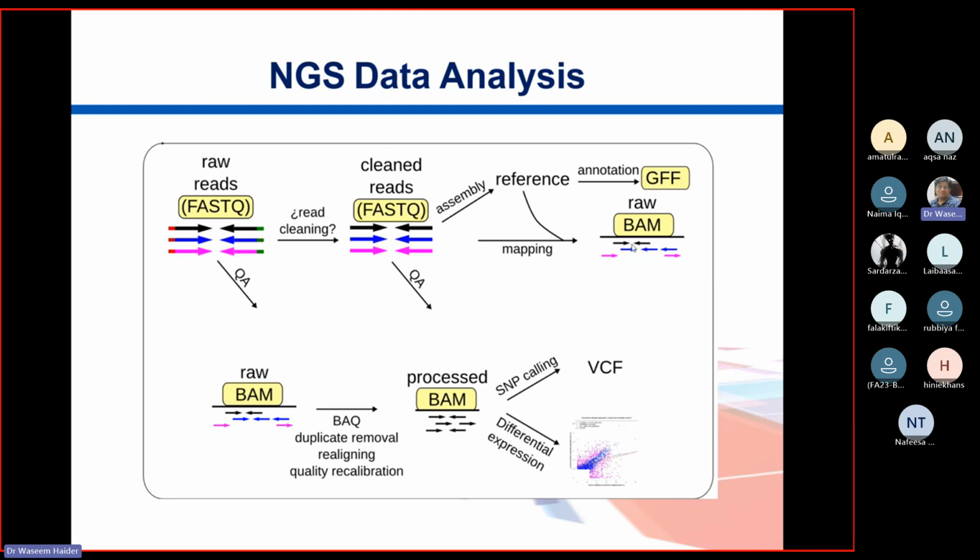So you have the reference, and this sequence is similar to what you have on the reference, and they are aligning from here to here. For example, position number 20 to position number 120. Suppose the read fragment is of size 100, so it is matching from here to here, right? In that case, this thing is called an alignment.